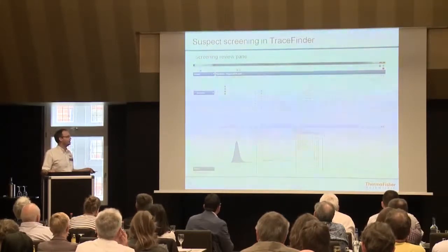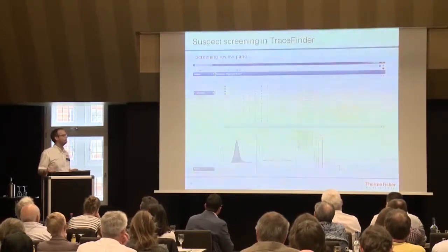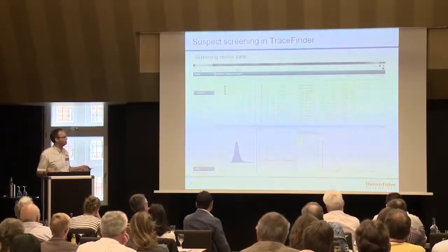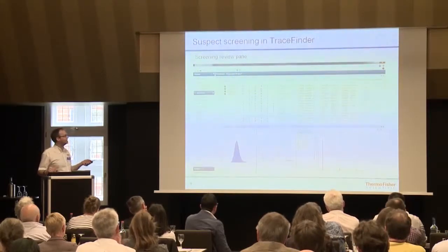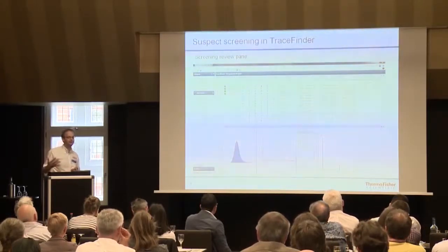So here we have this ion overlay to make sure the fragment ions are present and they show the same elution pattern as the main ion. Then you can look at the isotopic pattern match here. You could look at the library score here, or whatever you have as identification item here, you can make visible here, as you need it in that case.